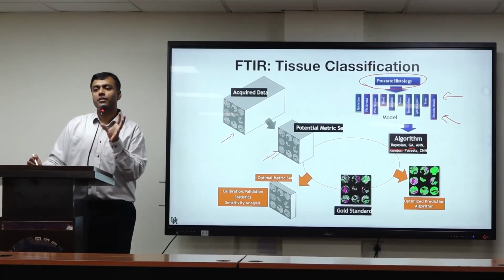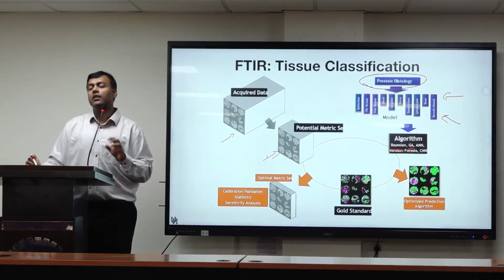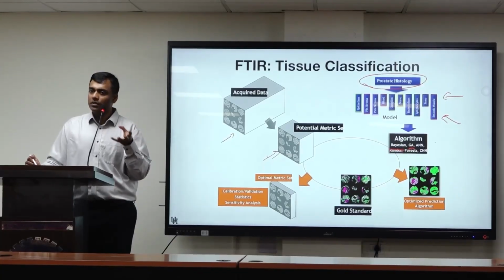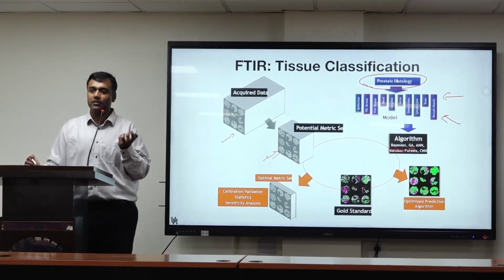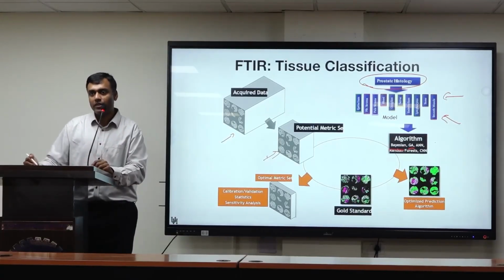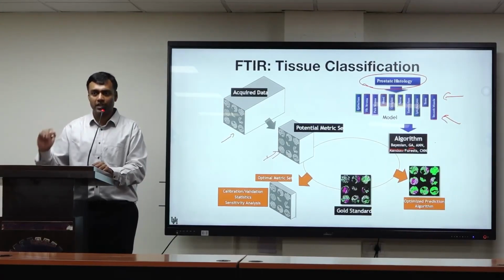If you don't know much about the data you're looking at and don't have prior information, then unsupervised methods are the way to go, where you look for natural variations.